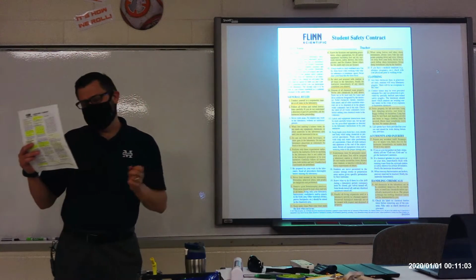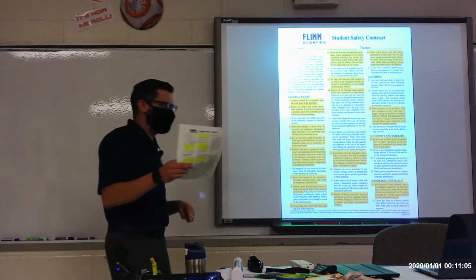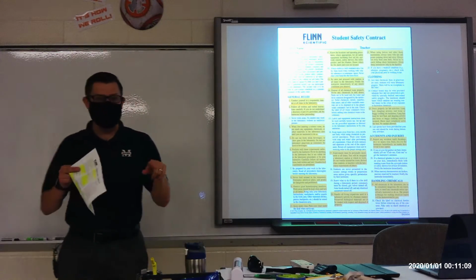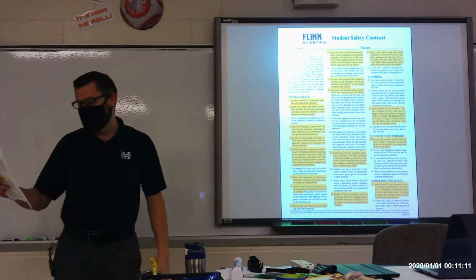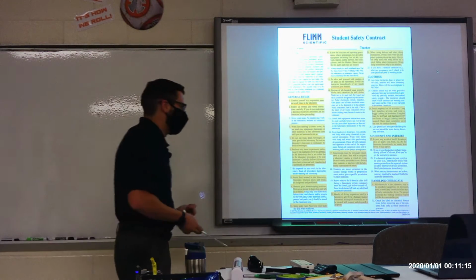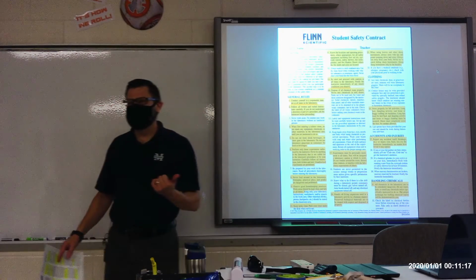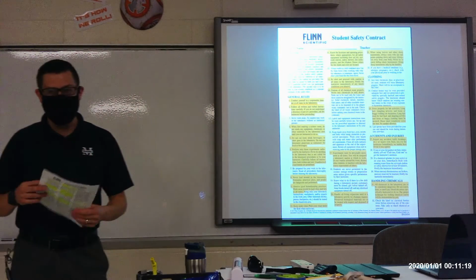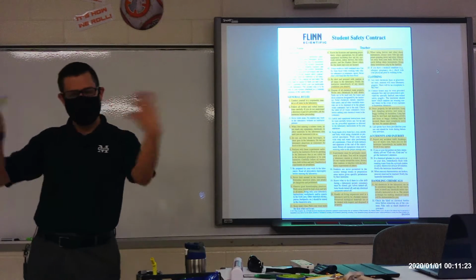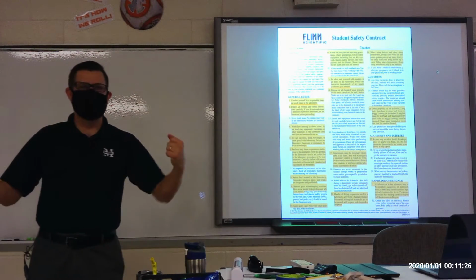Number 6, this goes along with following directions. Not only should you follow directions, you should not be doing anything that's not in the directions. So it says, perform only those experiments authorized by the instructor. I have plenty of times where students are getting creative and saying, well, what would happen if I did this? If I took this chemical and mixed it together, what fun happens then?